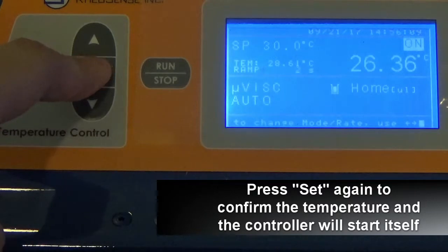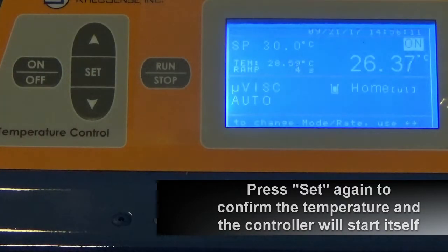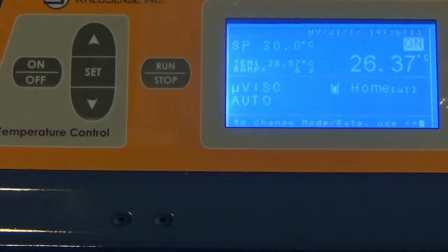The machine will heat up the samples until it reaches the desired 30 degrees. Only then can you press start to run the measurement. This is basically the temperature control accessory for the microVISC from RealSense. Thank you.